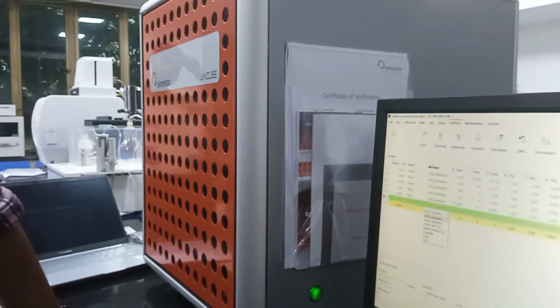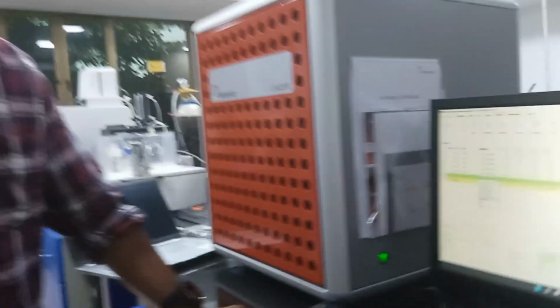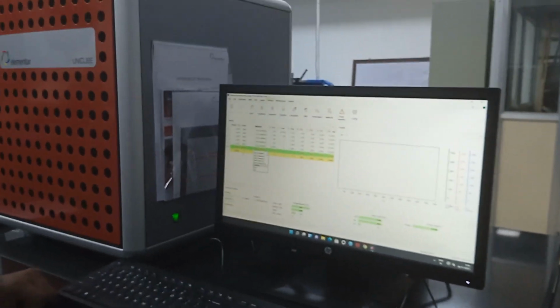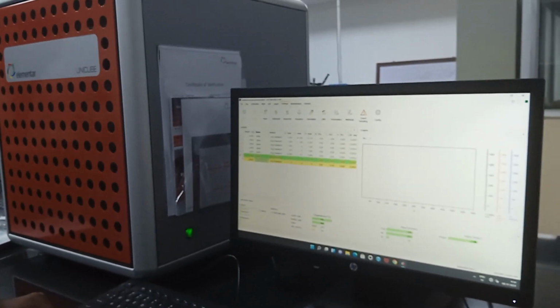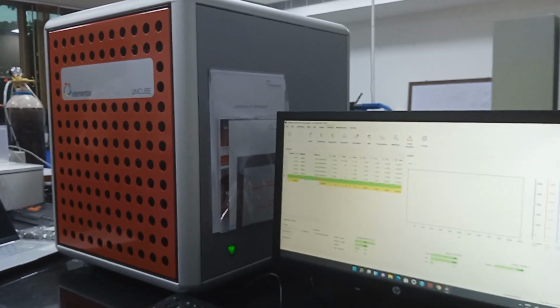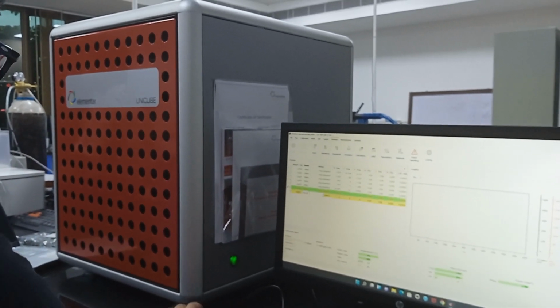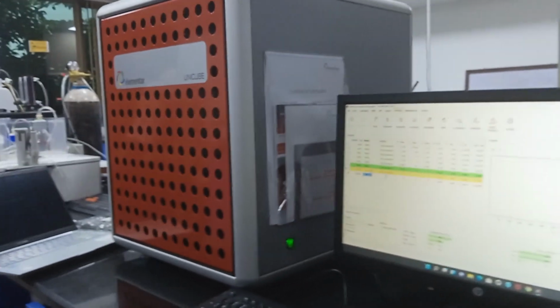How can you do it? There is a drop down. You can come here: soil, 5 mg standard is sufficient. If I just touch here, how can I write this? Double click it. Insert whatever you want. Press enter. Soil, easy. Soil blank.